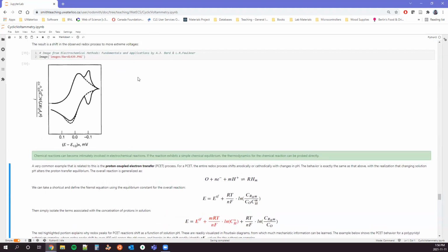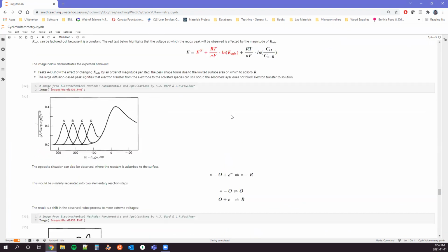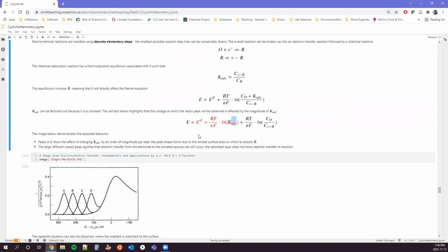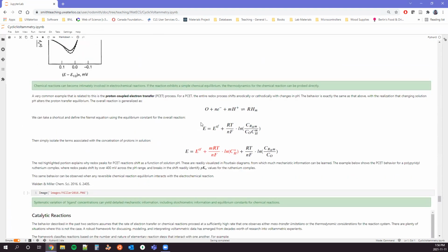These are all based on equilibria. We can look at changes in equilibria with the common example of proton coupled electron transfers. The key difference here is that in a PCET process, we can change the thermodynamic equilibrium that is this K-adsorbed species. Here we're not going to tune that K-adsorbed, but here we have the pKa of the species. As we move away from the pKa, we're going to change the equilibrium for protonation, deprotonation of our species. And so now we have a way of systematically changing what's going to happen in the system.